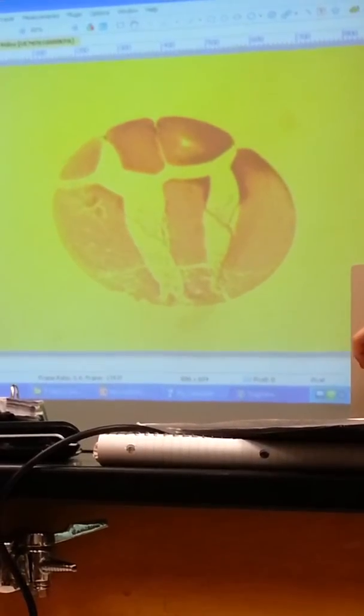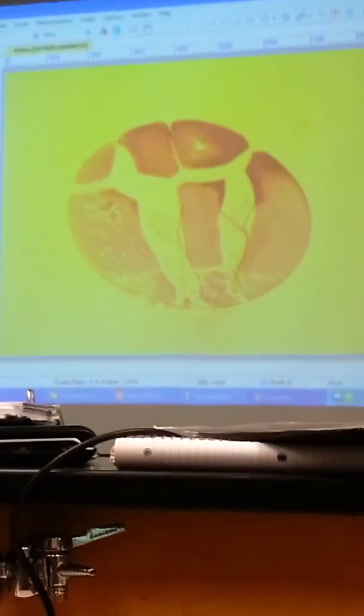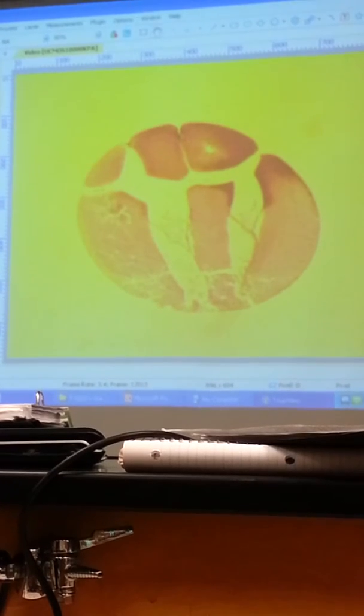What they did was they took the frog embryo, sliced it, and put all the little slices onto your slide. So if you're looking at one and it doesn't look quite right, you might slide on over to the next one, and you'll have a slightly different view of it. Now, this is the only one I have, and I don't really like it. This isn't quite test quality.